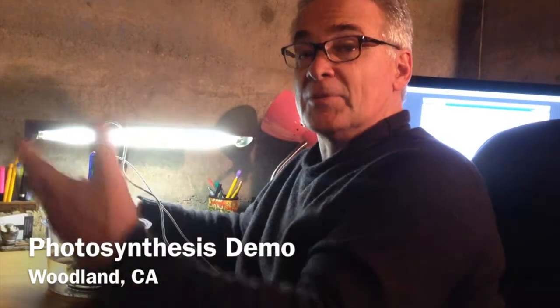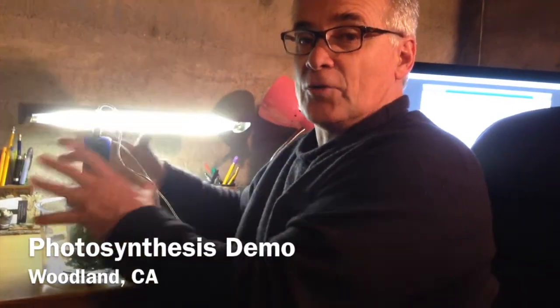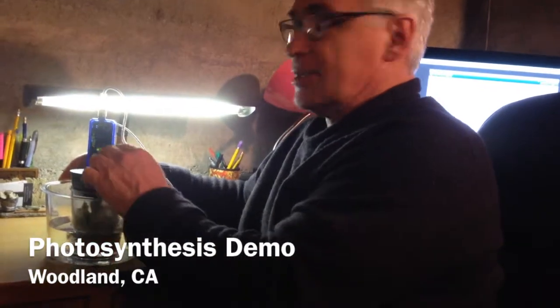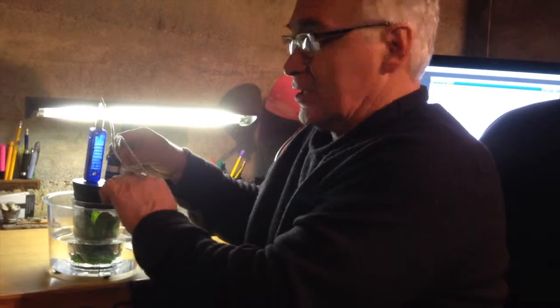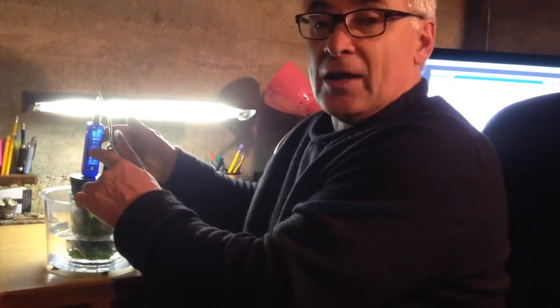All right, our demonstration today is on the photosynthetic process. Today we're going to measure two gases: the oxygen gas, which is the small one, and the carbon dioxide gas.